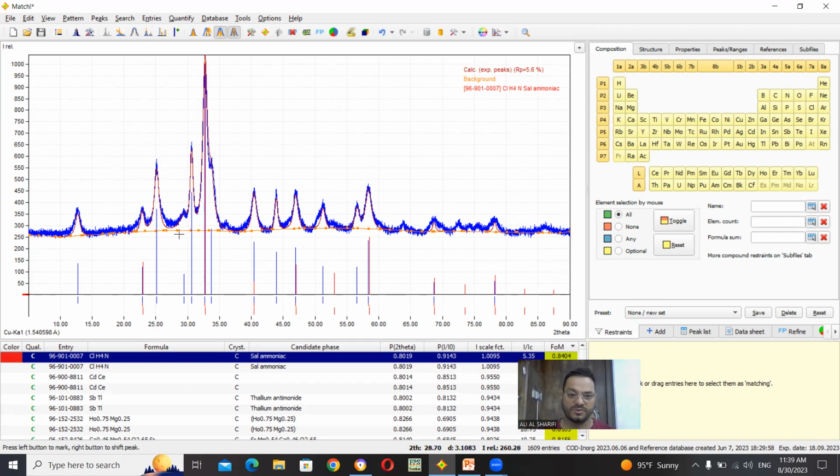We have some impurities here. Not impurities, sorry. It's the impurity diffraction. If I use the impurity diffraction, I'm sure it will be better to illustrate this situation. This line must approximately follow the curves.